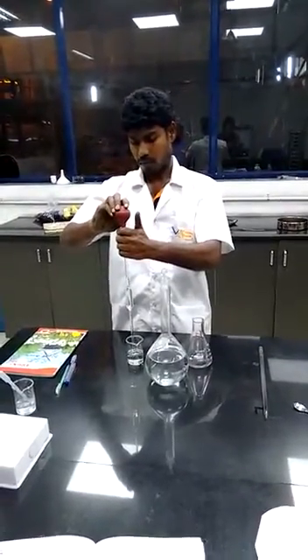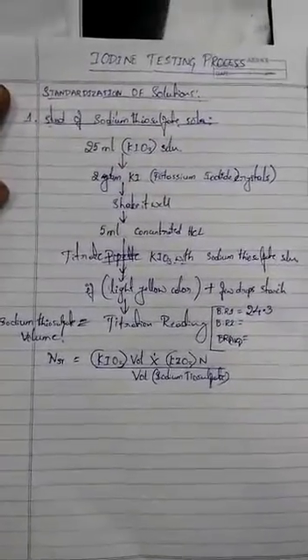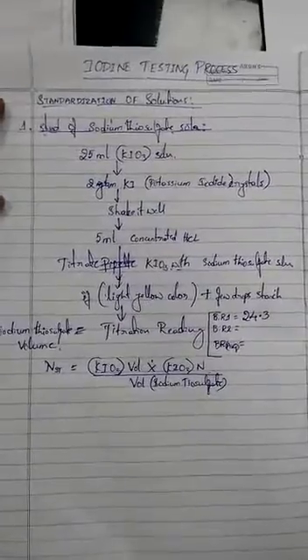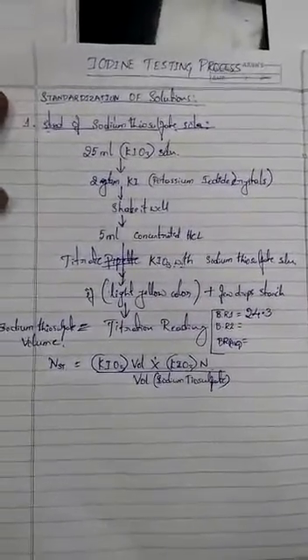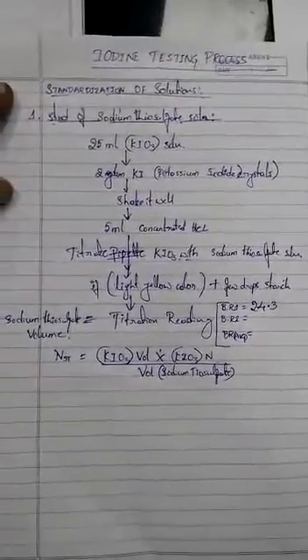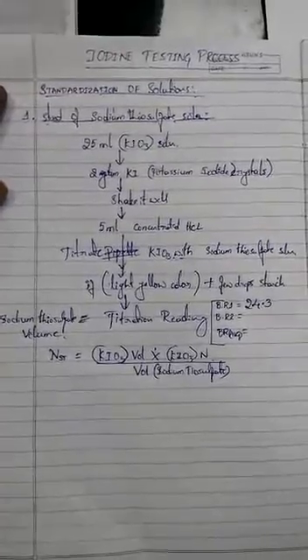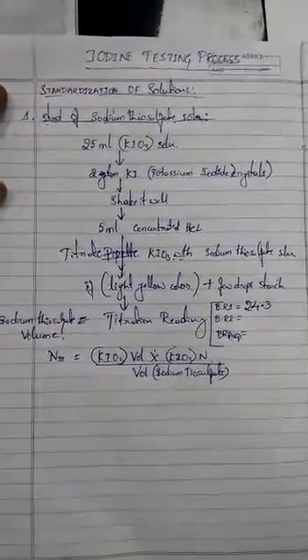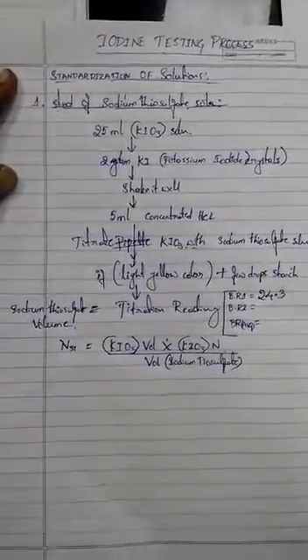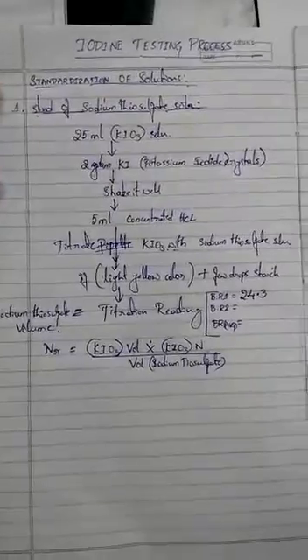Let's go through the procedure again. Add 25 ml of KIO₃ solution into a conical flask, then add two grams of potassium iodide crystals and shake it well. After that, 5 ml of concentrated HCl has to be added to remove any sulfur content in the solution, so the iodine is now free. Then titrate the KIO₃ solution with sodium thiosulfate solution in the burette.